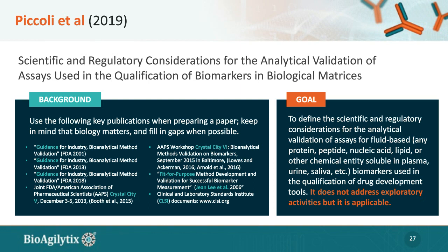So, although this paper is not 100% applicable as is to the exploratory phase 1, phase 2 biomarker world that we live in, many of the concepts in this paper are very much applicable, and a modified form of these concepts or acceptance criteria recommendations could be used, should be used, as you prepare and modify your SOPs and as you do your qualification or validation.